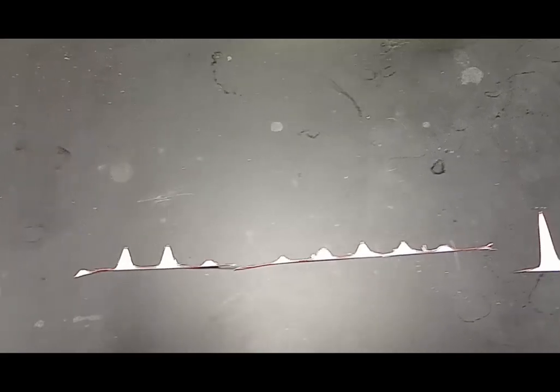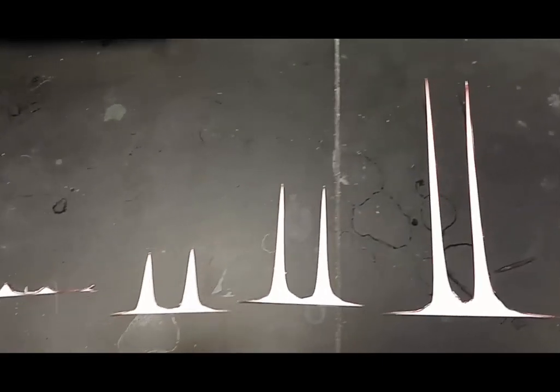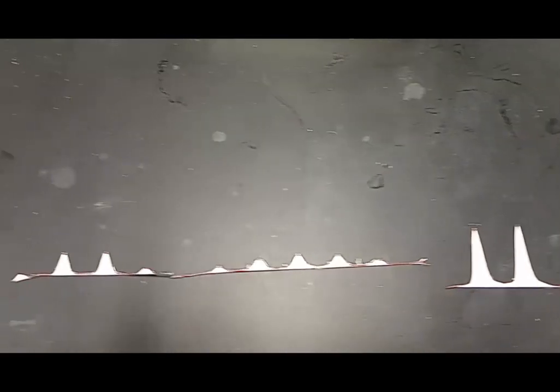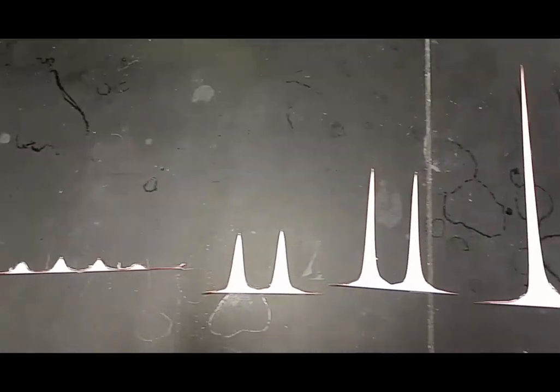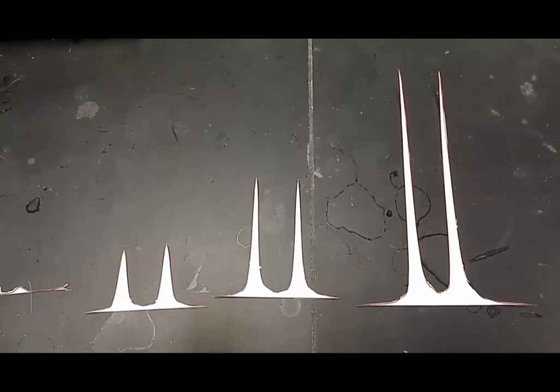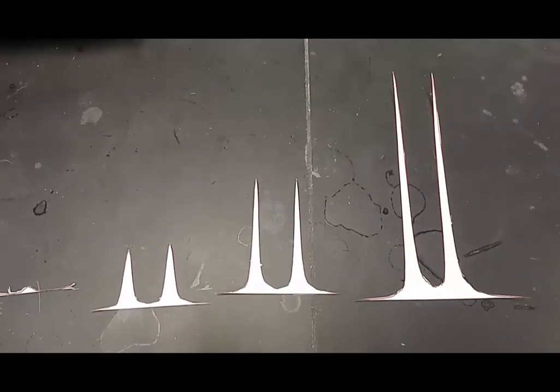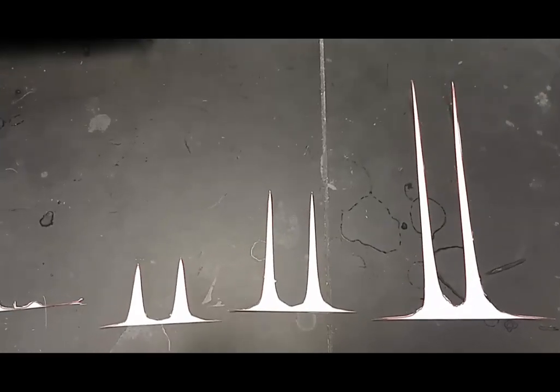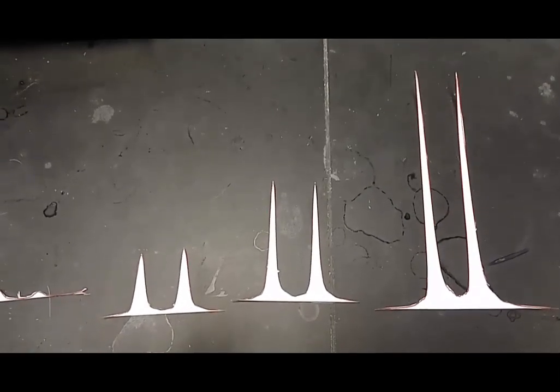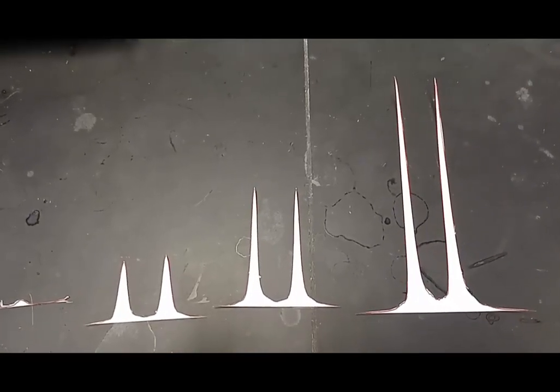It should hopefully be obvious, just looking at the various peaks here, that the quartet and the nonet integrate for the least and have the smallest amount of paper involved, whereas the doublets are all larger than that. And then, of course, it should be obvious which of the doublets should have the highest mass, because the area under the curve is largest, the peak is physically largest. But in particular, looking at the doublets, it should be clear which one integrates for 2, which one integrates for 3, and which one integrates for 6.